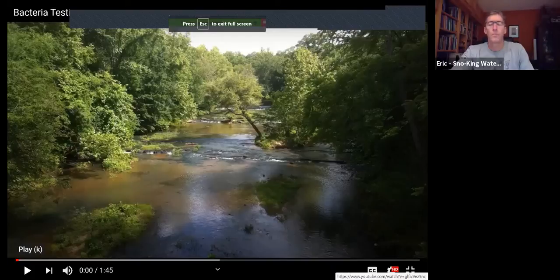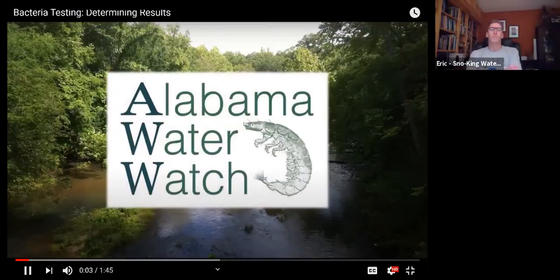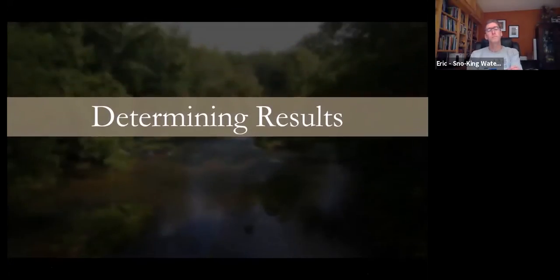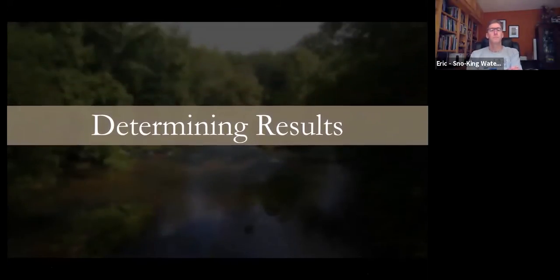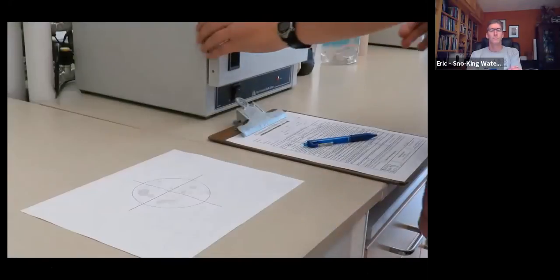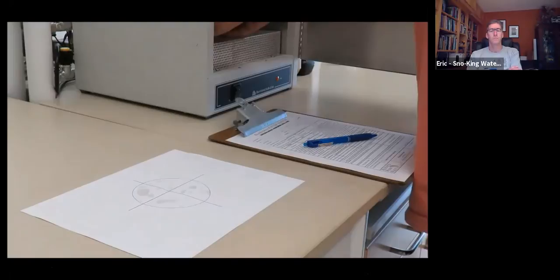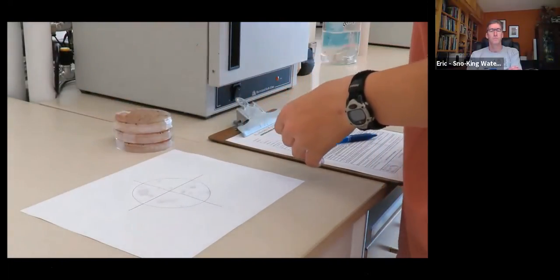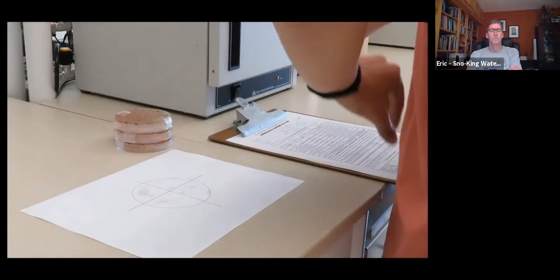Welcome to the Alabama Water Watch instructional video series. This video will show the proper method for determining the results of incubated water samples. This is the third step in a three-step process. The first and second steps, collecting the samples and plating the samples, are covered in their own separate videos. Remove plates from the incubator, being careful not to spill any liquid. Be sure to record the incubation period, which is optimally between 30 and 34 hours.